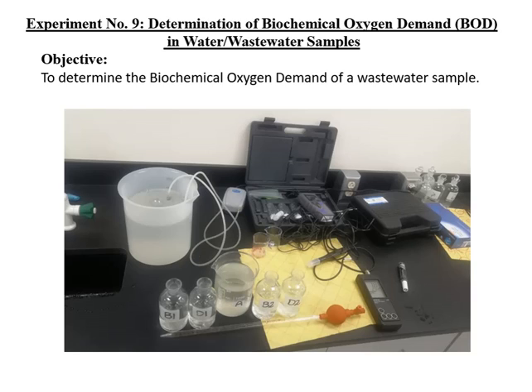We will have a sample containing some waste material like this one and this one, and there are some instruments we have to use, like the dissolved oxygen meter, right? And we will also use the incubator, like a fridge, and we will use aerated water as the dilution water, which contains some nutrients.